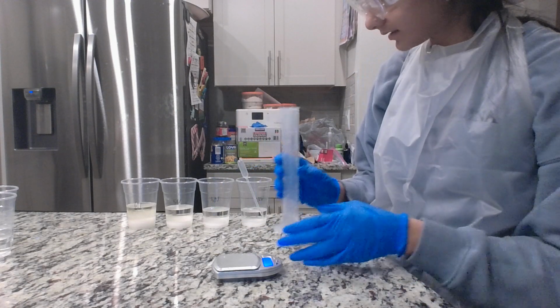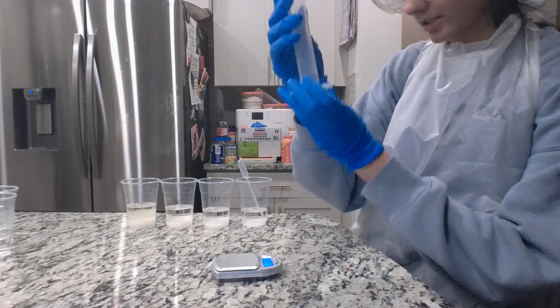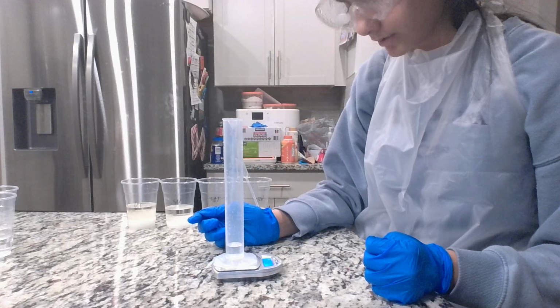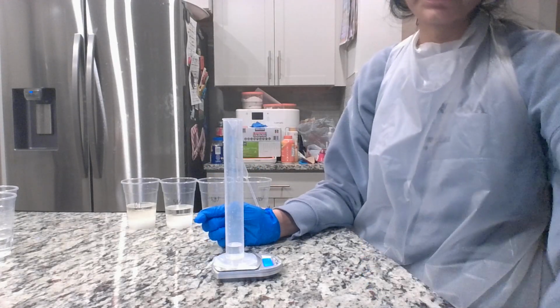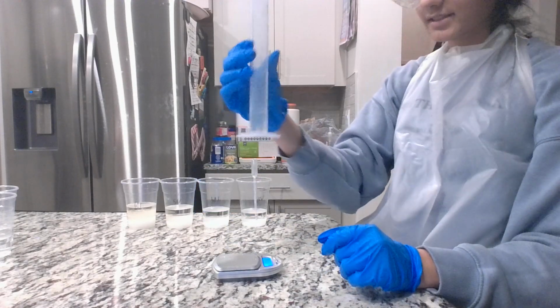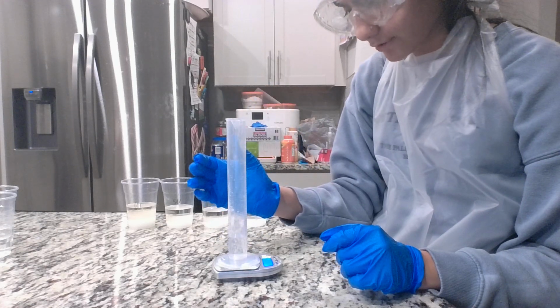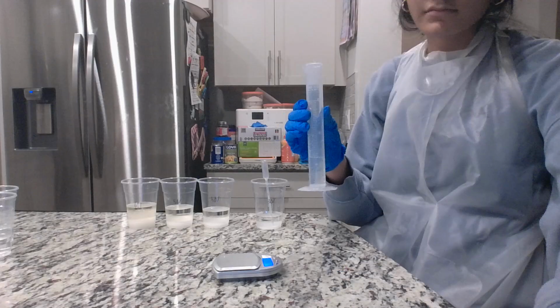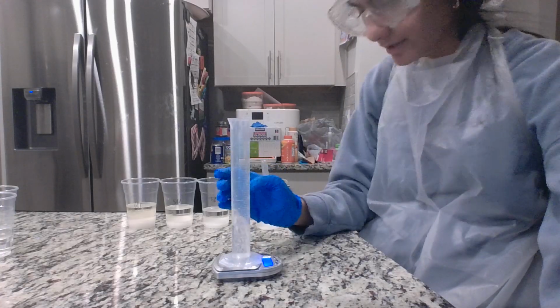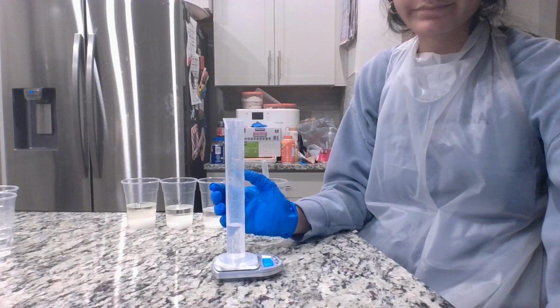So this is now 30% of sucrose in solution, and there's 5 milliliters of it. And it weighs about 36.24 grams. Now this is 10 milliliters of solution, which weighs about 41.32 grams. This is 15 milliliters, which weighs about 47.33 grams.